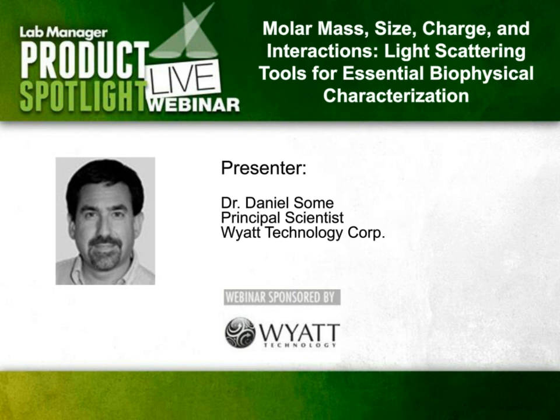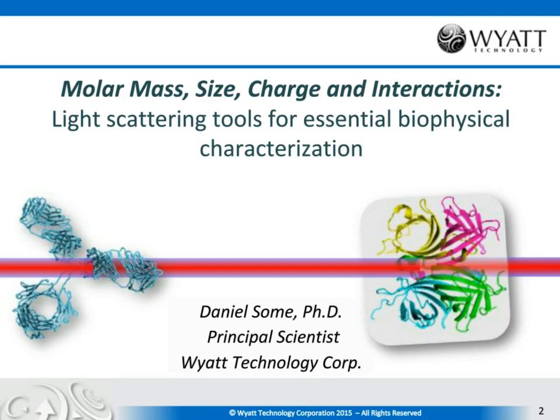As Trevor mentioned, the topic of our talk today is molar mass, size, charge, and interactions. You may not normally associate some of these essential properties of macromolecules and nanoparticles with light scattering, but as we'll learn today, there are some really useful tools associated with light scattering that can help you assess these properties.